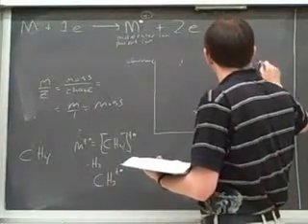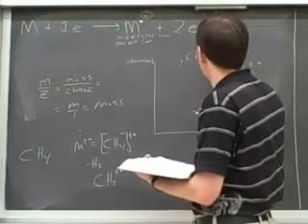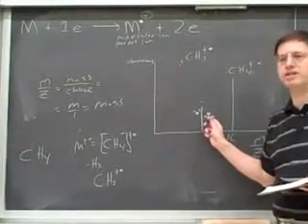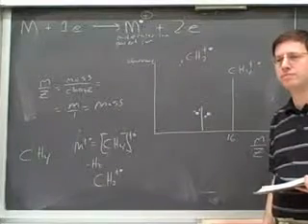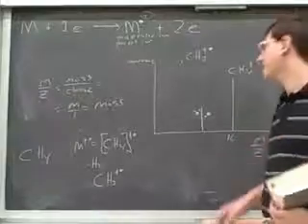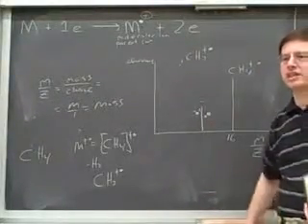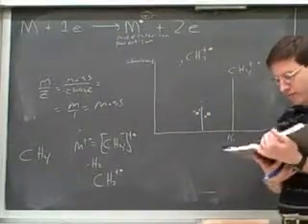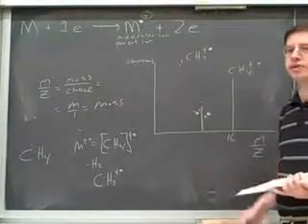How do you know the relative heights? Well, in many cases, you can't predict them ahead of time. You just look at the piece of paper to see what the relative heights are. Okay. So they wouldn't have us draw a spectrum? Probably not. They wouldn't make you draw the whole spectrum. Now, there are some cases when we can predict things about the relative height, so hopefully we'll have time to talk about that in a second. In some cases, we can make predictions about the relative heights, and in some cases, we can't. But in any case, if you look at the printout, you'll see what the relative heights are.